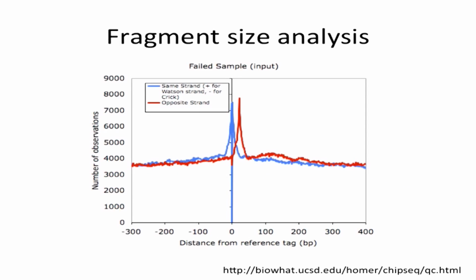And if you have an experiment where you don't have a good peak content, if your data set is not peaky, doesn't have too many peaks, if basically the DNA reads are mapped randomly across the genome, you would get more of a distribution of distances like this, that shows very little difference. Basically, the difference between the two modes of this distribution is equal to the size of the reads. That is a failed experiment that doesn't have any peaks.